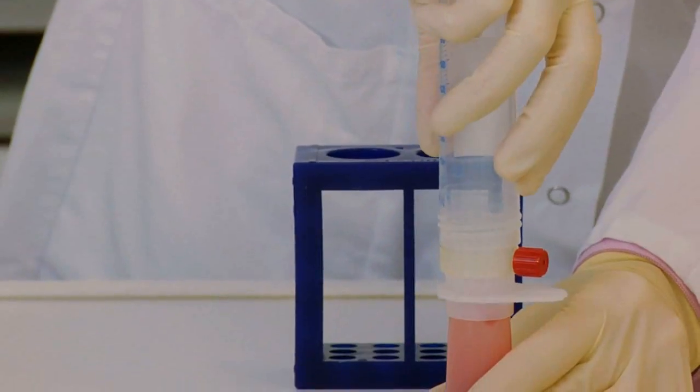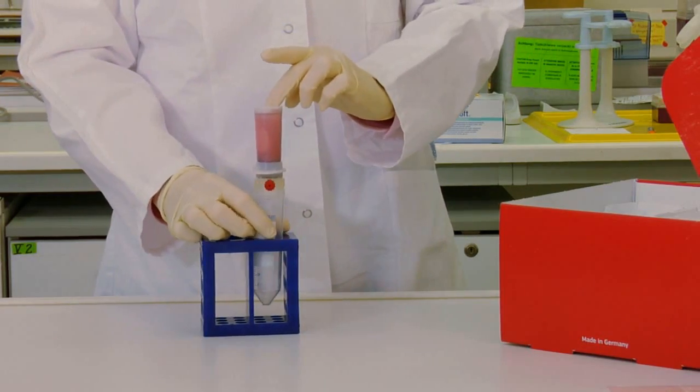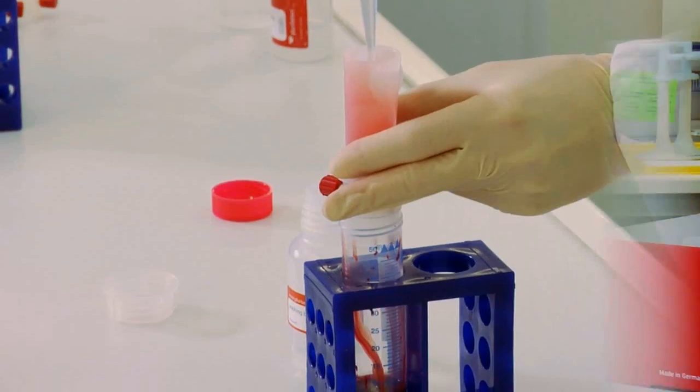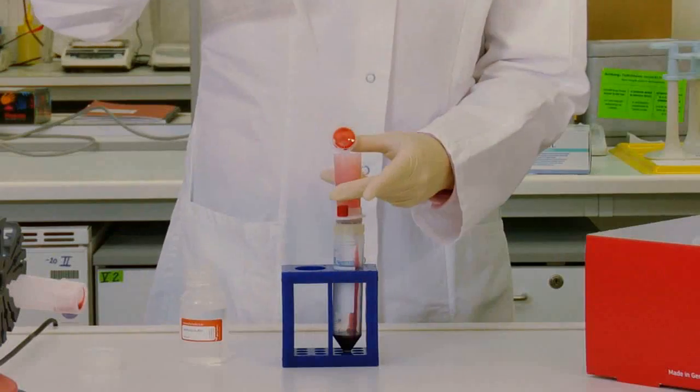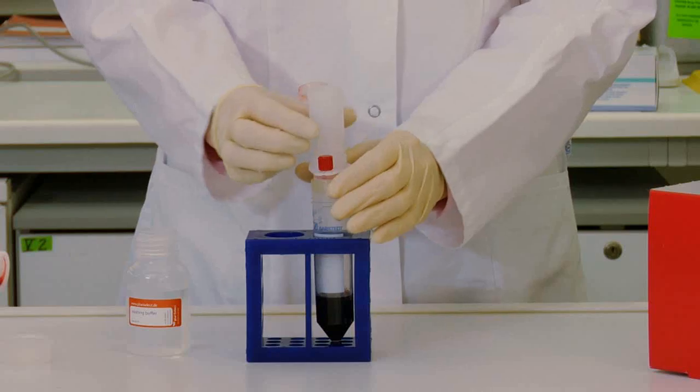Everything is turned upside down so that the sample material can flow through the sieve. The target cells which have bonded with the catcher particles are held back by the sieve. Unbonded sample material flows through the sieve into the centrifuge tube.